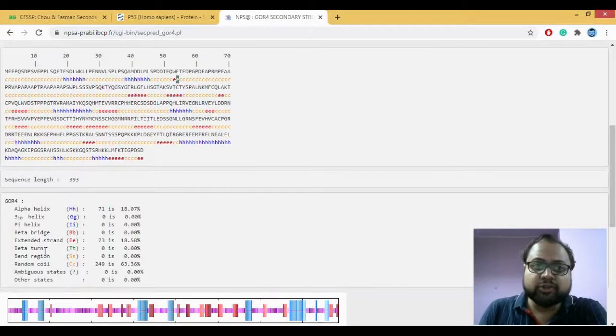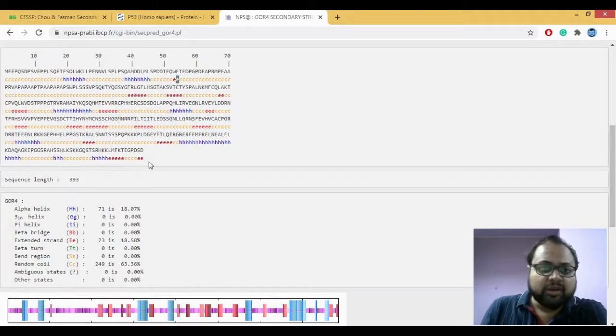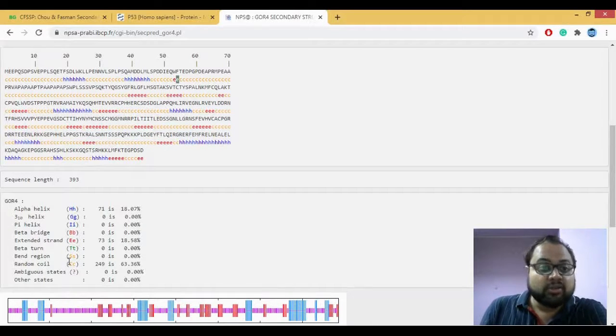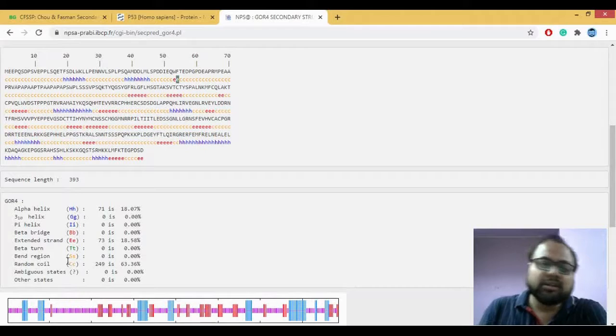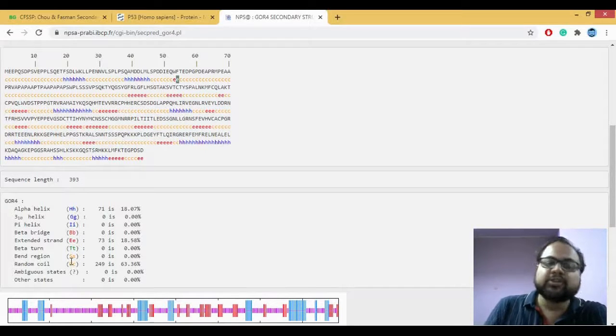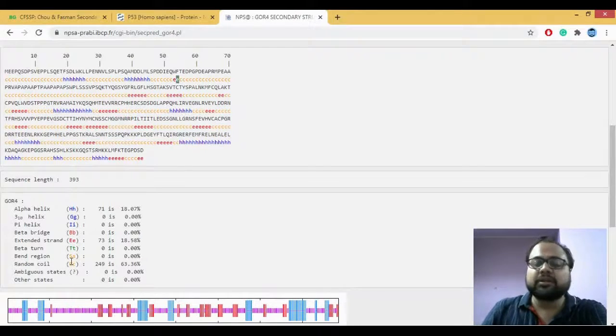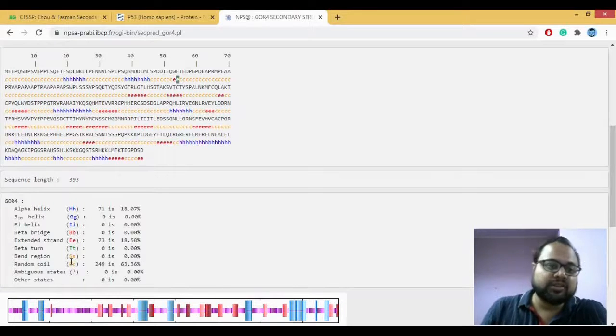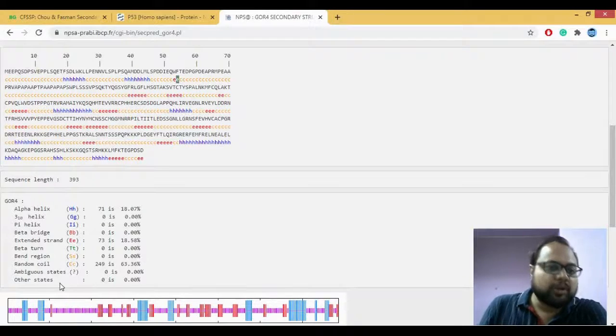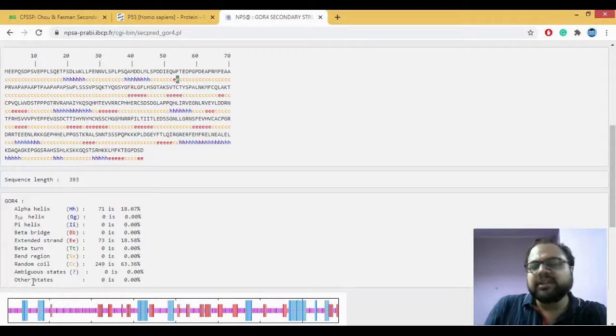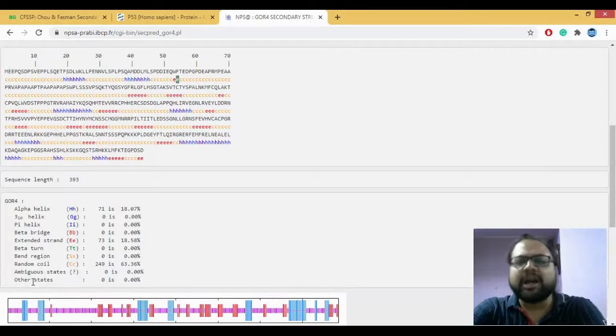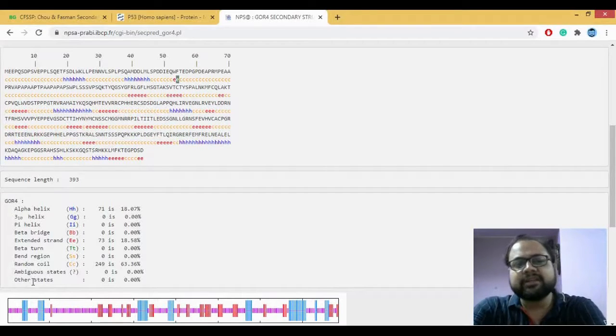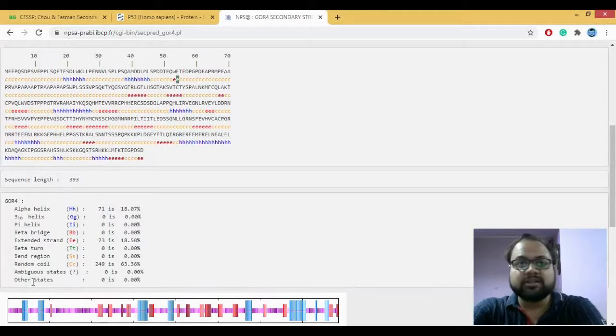There's also your beta turn which is T. So it also helps us predict your turns. There's obviously your coils, the coils or the loops which joins the two secondary structures to each other. And there's always an ambiguous state or other states like if there is any sort of ion which is present in the sequence then it's present in the other states.